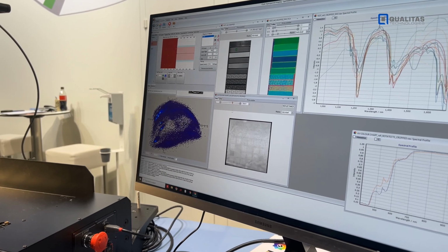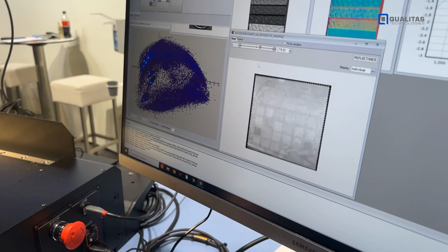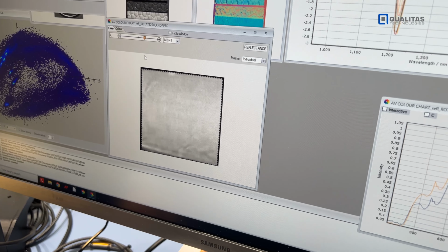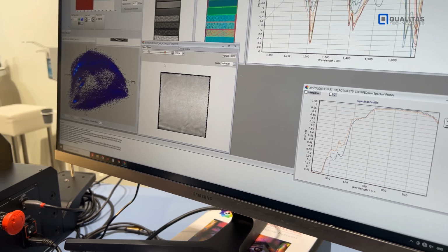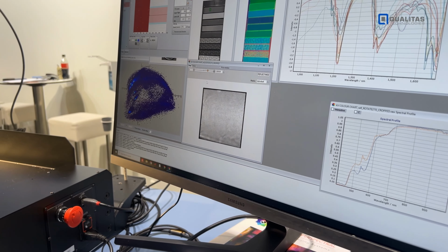So we can see which one gives you the most contrast. We can also see where the inks in this particular object become invisible. At around 700 nanometers, the dyes in this, I think it's a cloth for cleaning spectacles, become invisible.